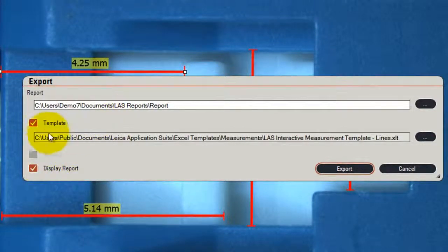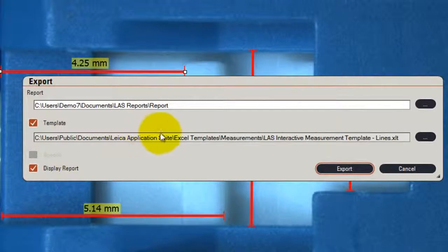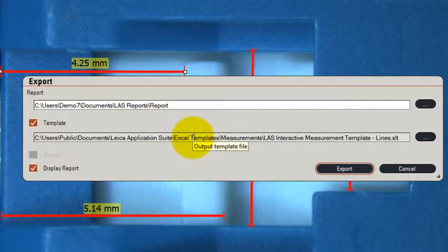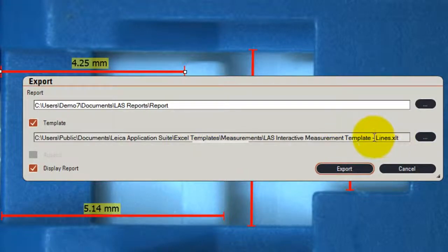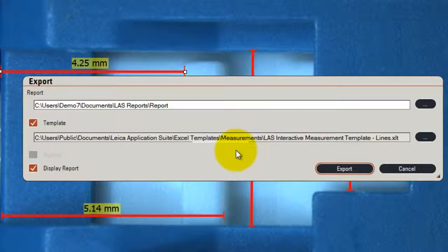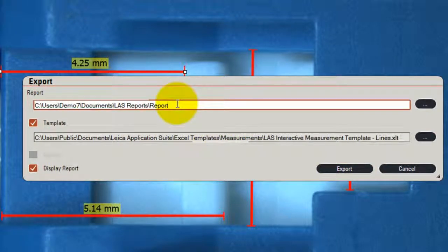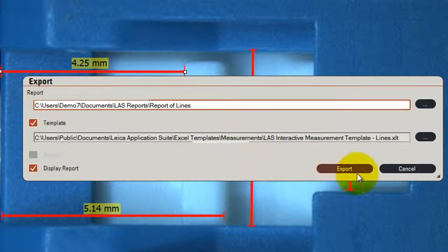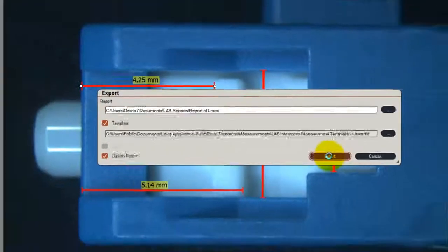The data is sent to an Excel template which is easily customizable to include your own logo and calculations that you need to do. You can see the one I've selected is called Lines because I've got some lines on this image. I can enter a new name for this report, report lines, and when I click Export.